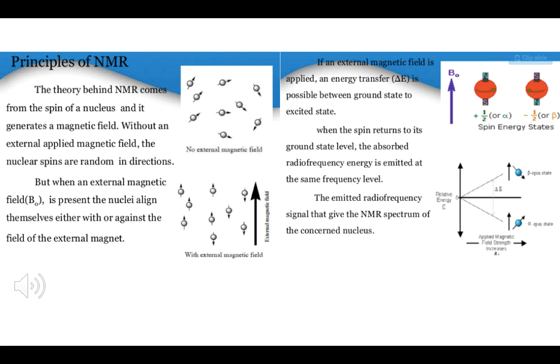a visual of how the atom looks. So basically, I'm going to focus on proton NMR. Proton NMR is a powerful instrumental method that identifies protons that are in slightly different electronic environments by inducing magnetic fields and electrons around the nucleus.